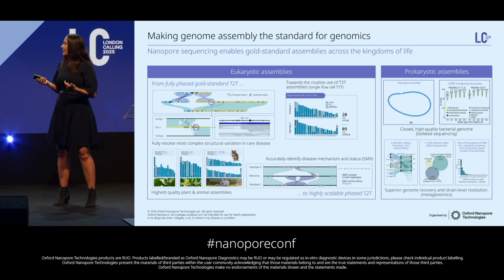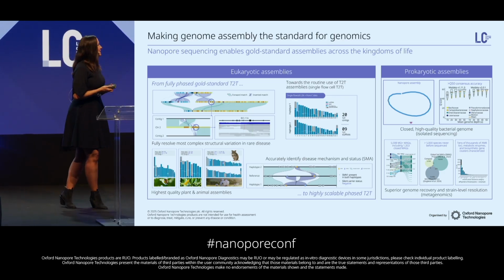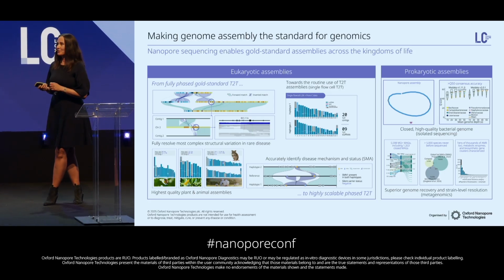On the prokaryotic side, we can use it for isolate sequencing and, of course, for metagenomic sequencing. And then the second thing I'd like you to take away is that you should really be doing your assemblies with nanopore sequencing because it just works really well.